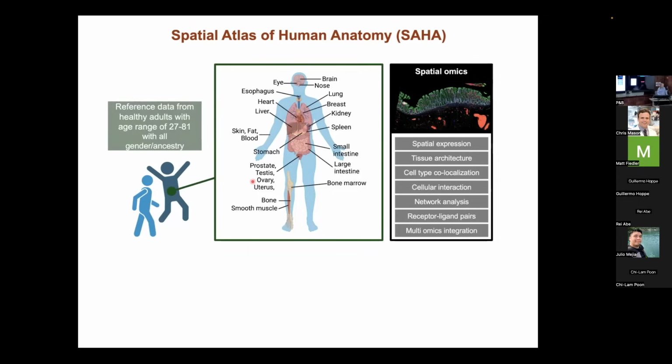Can I ask, what is the average number of spatial samples that you have per person? Does it seem very extensive? Yeah, the goal ultimately is that we're going to have 12 patients, 6 women, 6 men. And then from within the individual patients, it depends on the tissue.